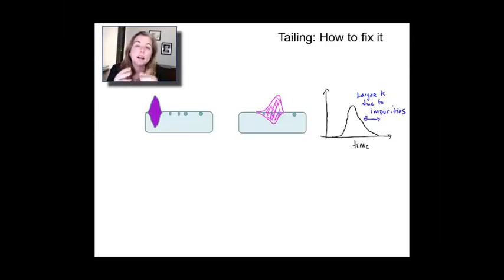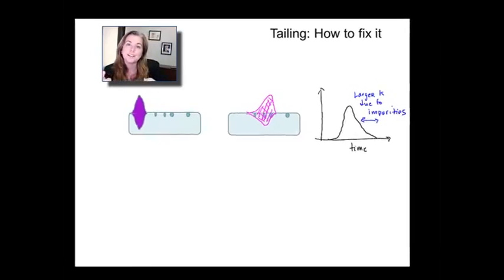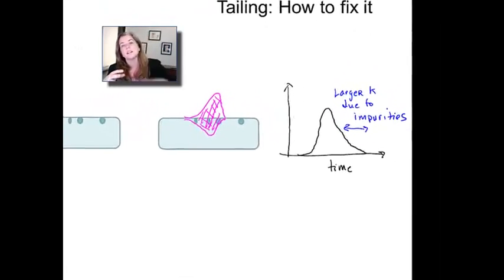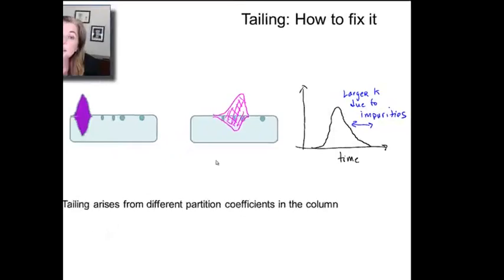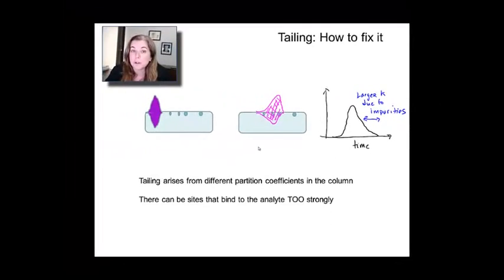And what that does is it stretches the peak out because some of the material is kind of hanging onto the column. And so, what you see then is a nice front end going to be quite as symmetric, but you get this long tail to longer elution times because these defects are hanging onto the analyte and kind of keeping them in place.